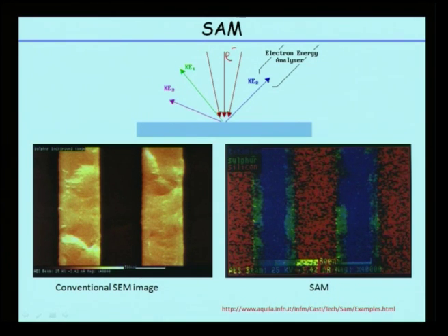This image actually is, the blue is basically titanium. This is taken from a website, not from my work. The sulfur is the green, and red is basically for silicon. As you can see, this is the cross-section conventional SEM image, which doesn't give much data. It only shows there are different areas, the sample surface, red and black. This has been made color. I think this is the sulfur backscatter image, so these are the sulfur regions. As you can see here, sulfur is green.